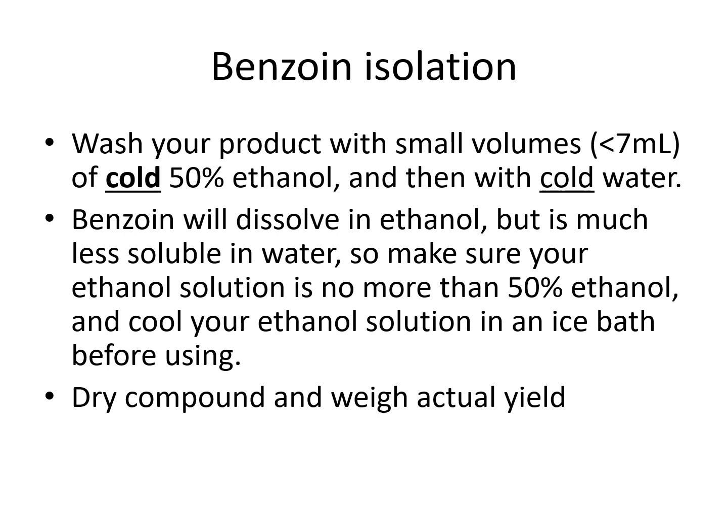In washing benzoin, we have to stick to using 50% ethanol and cold water. Most importantly, the 50% ethanol is necessary because benzoin is soluble in ethanol, but it's insoluble in water. So that's the important procedure that we have to stick to here. And then we dry our compound and weigh the actual yield.